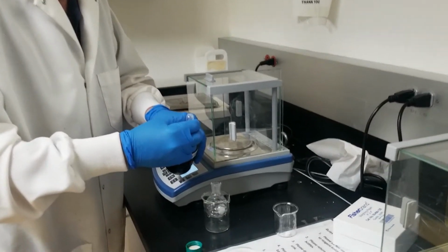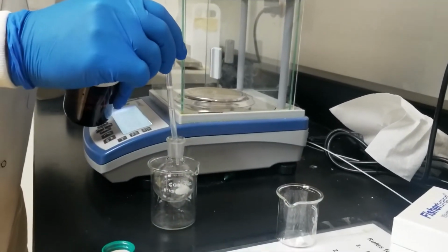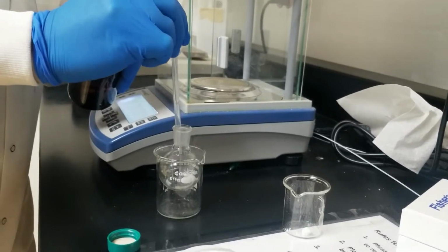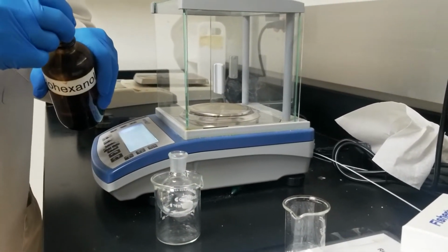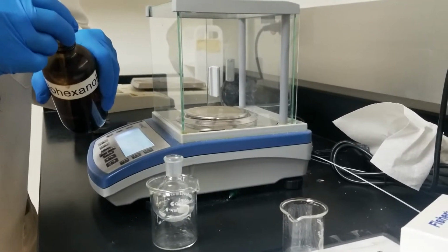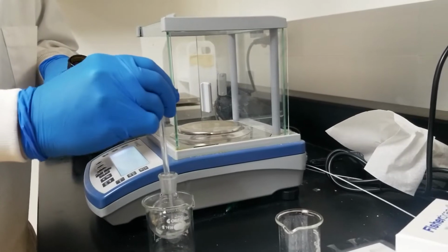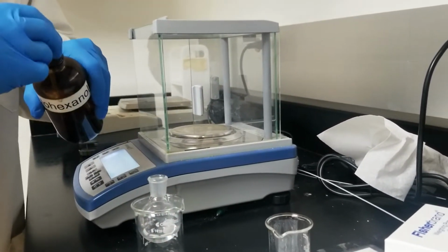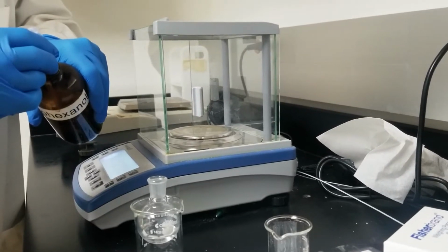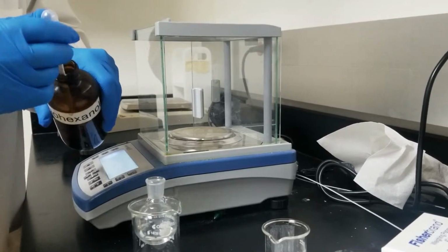And this stuff's kind of viscous, so it takes a little while to get it up into there. That looks like a couple mils on that one. So I'm guesstimating, I don't know, 5, 6 we put in so far, so maybe a couple more squirts. And then we'll just take a little measurement of it and guesstimate what that 10 to 12 would be. And like I said, I didn't look up the density exactly, but I'm estimating it's probably about 0.8 grams per milliliter.